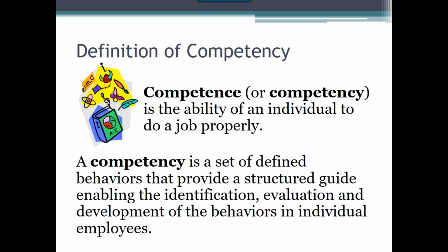It essentially confirms that the employee has the tools and the ability to do a job properly. So in short, training is showing someone what to do, and then competency is ensuring that they can actually perform the task on their own and that they are able to do what they were shown.